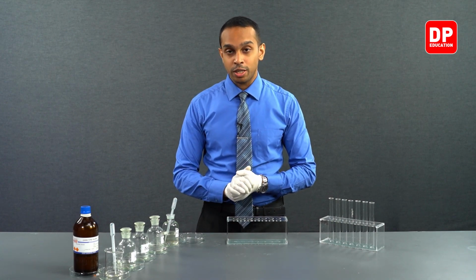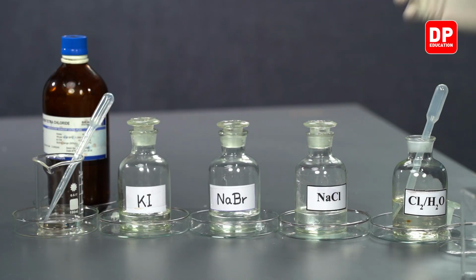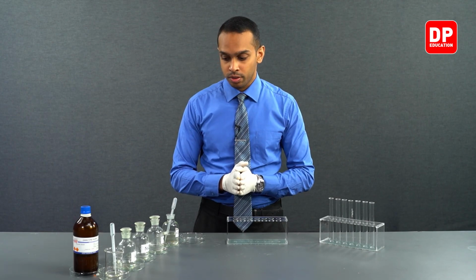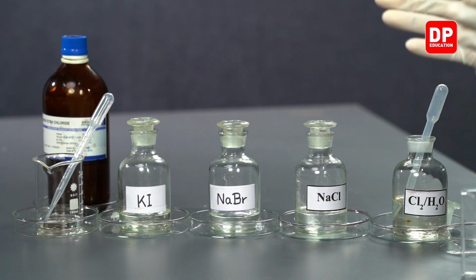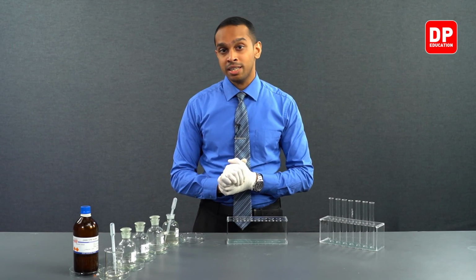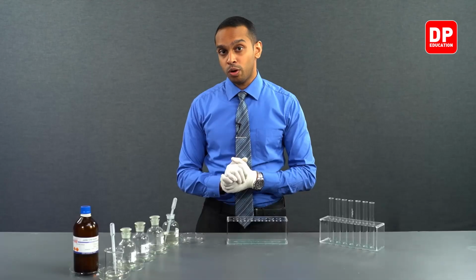For example, if you take sodium bromide, when sodium bromide reacts with chlorine water, Br minus ions will be displaced as bromine or Br2. If you take potassium iodide, the iodide ions in the potassium iodide solution will be displaced as I2 or iodine in the medium, right? So without further ado, let's move on to the chlorine test.